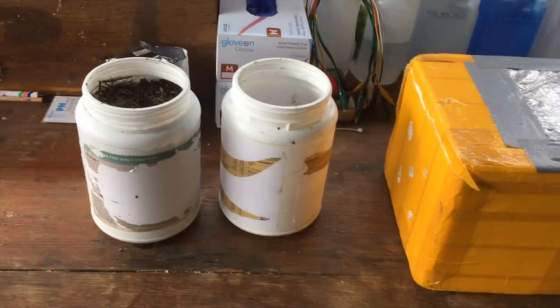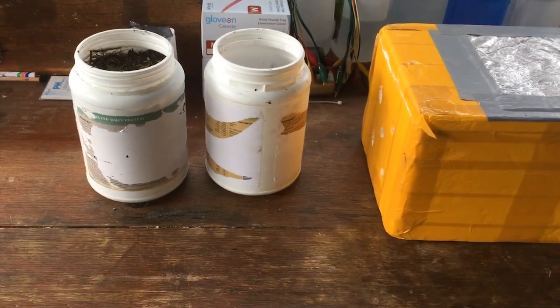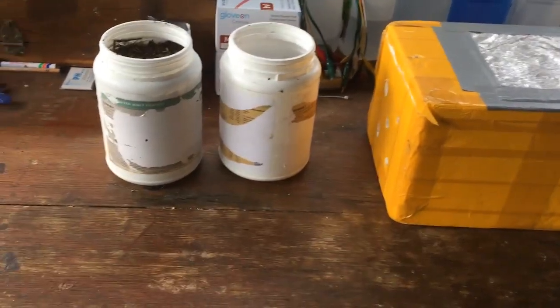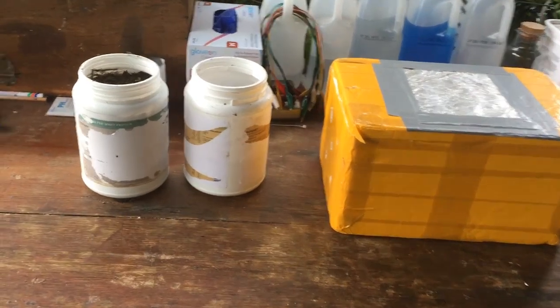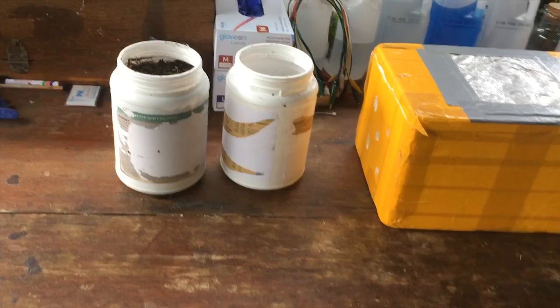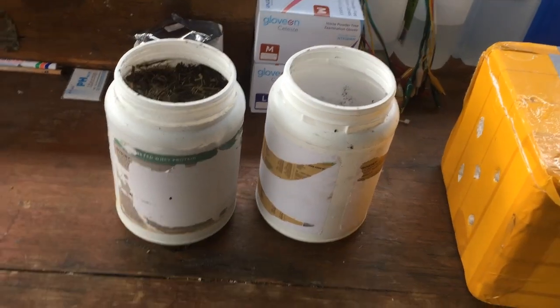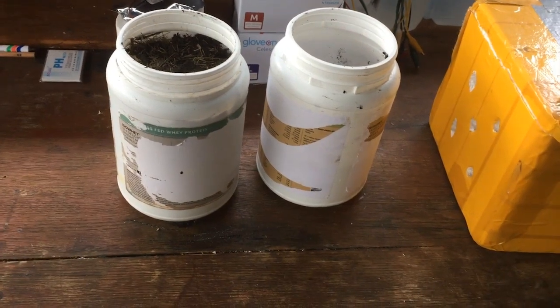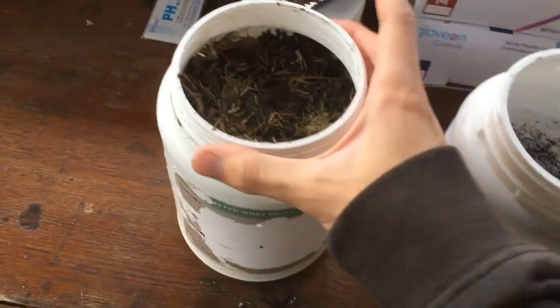So we have to go about extracting nitrates or nitric acid from other stuff, which I'm going to have a go at today. A bunch of people have asked me to do this and I've had this idea for a while, so finally today we're going to get around to doing that. What we're going to try extracting the nitrates from, turning into nitric acid, is compost.